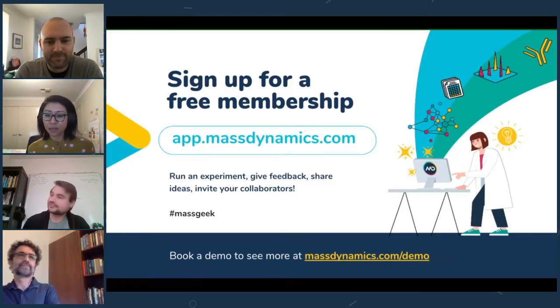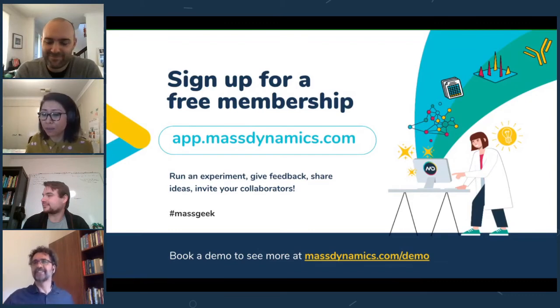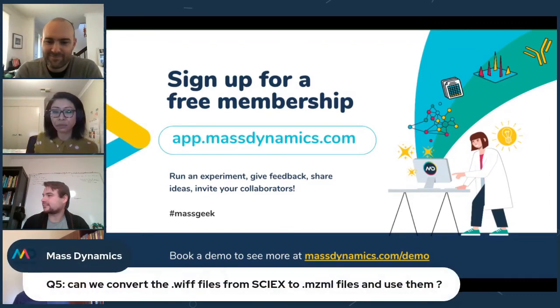Okay, there's another question that's come in. It's another SciEx question. Can we convert the .wiff files from SciEx to mzML files and use them?